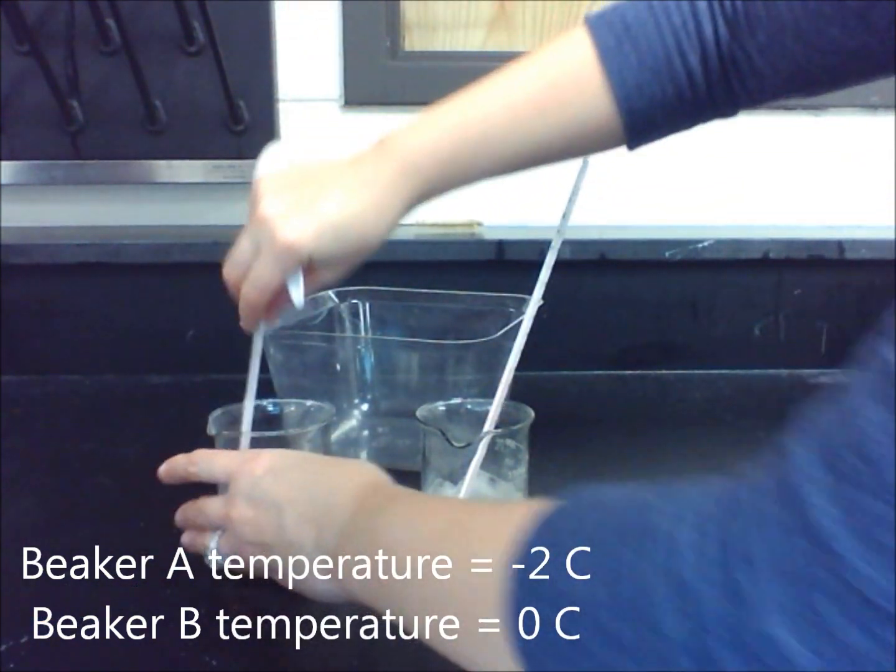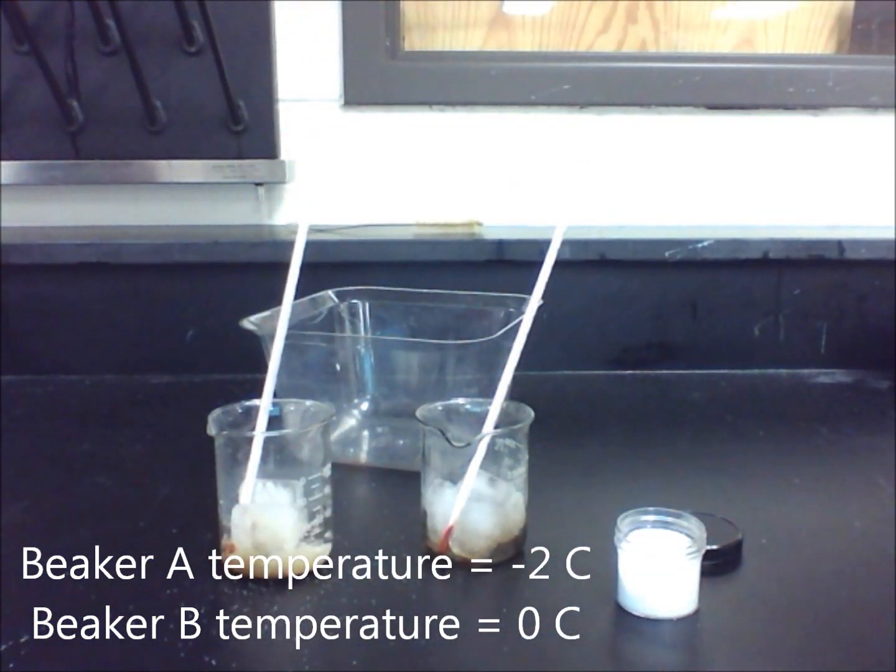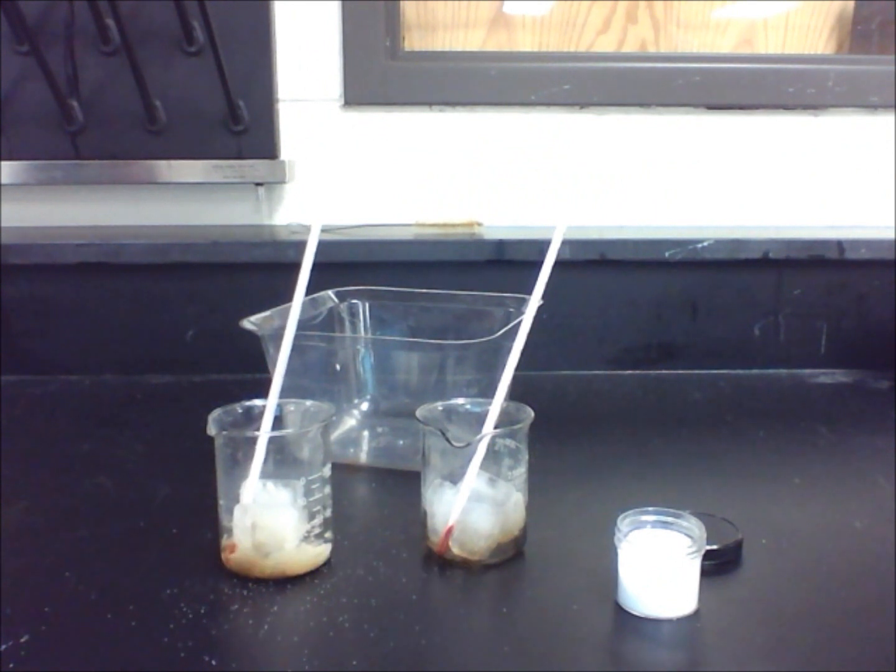Measure the temperature of the crushed ice in beaker A and beaker B. Record your results in table 1. You should have noticed that the temperature decreased significantly for beaker A.